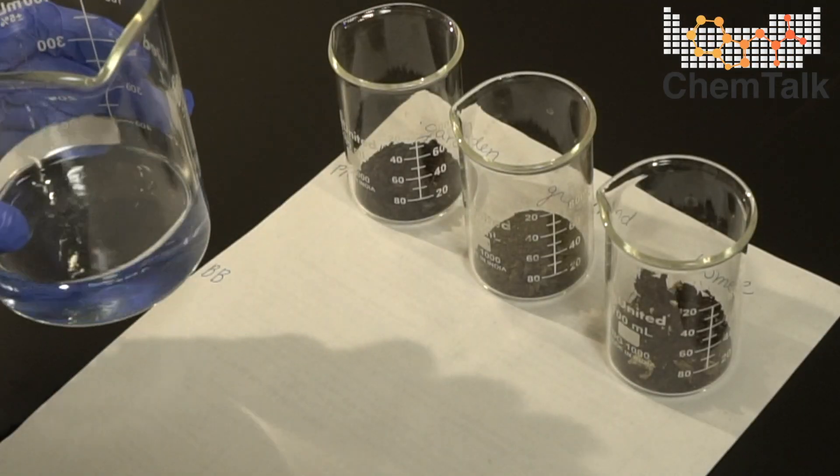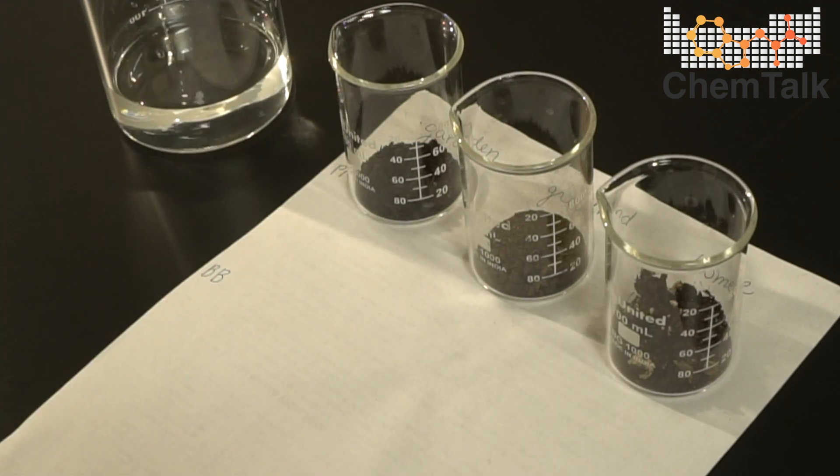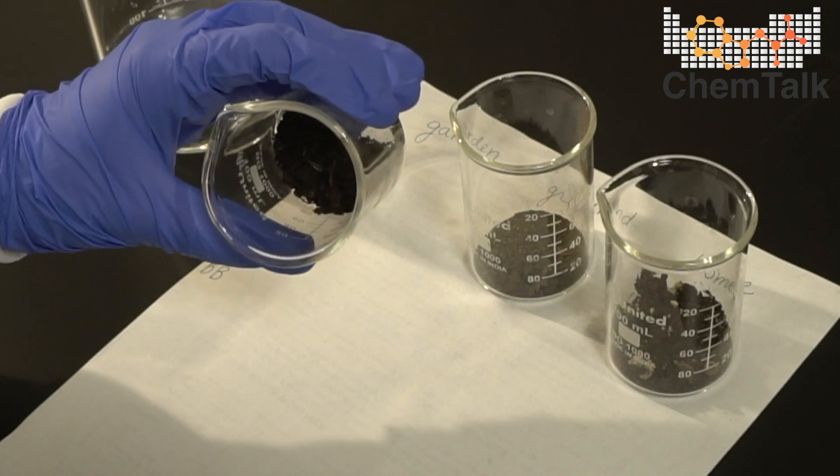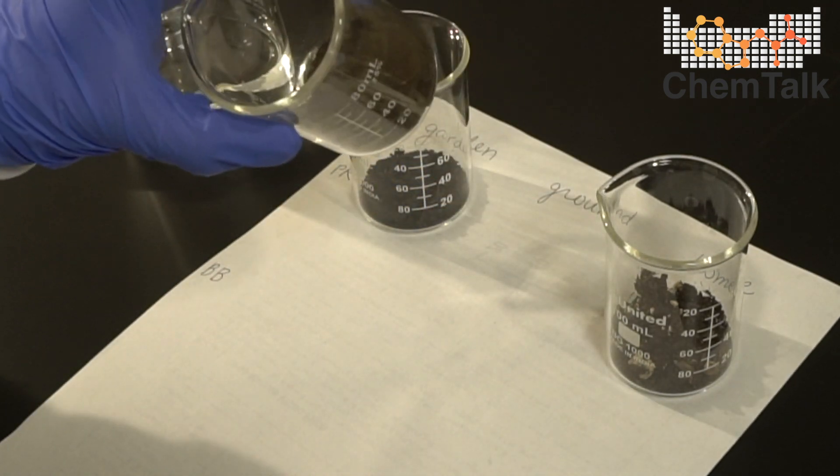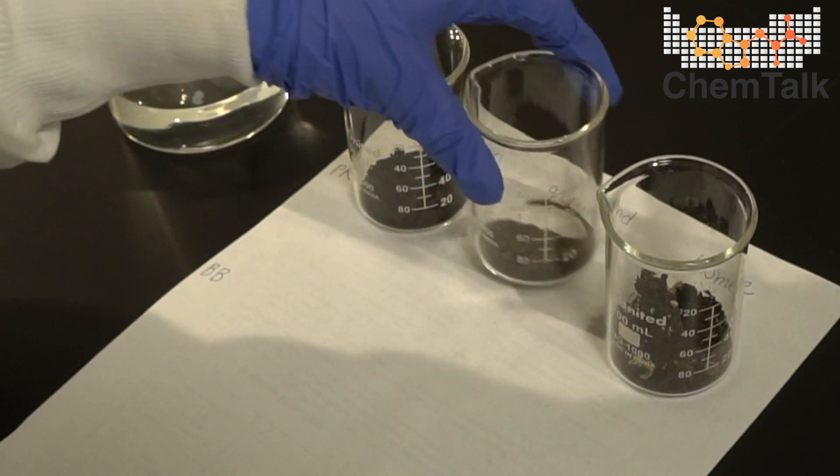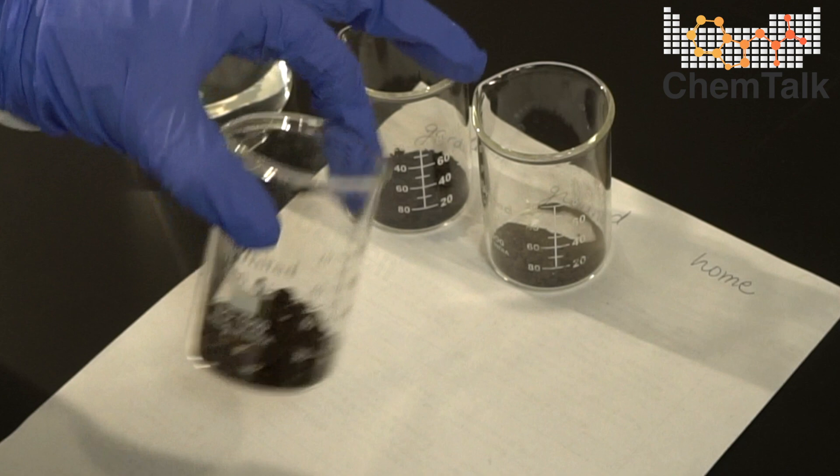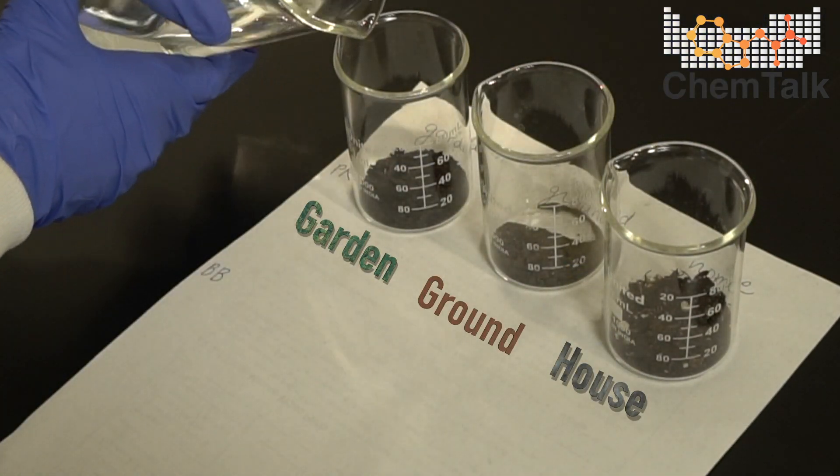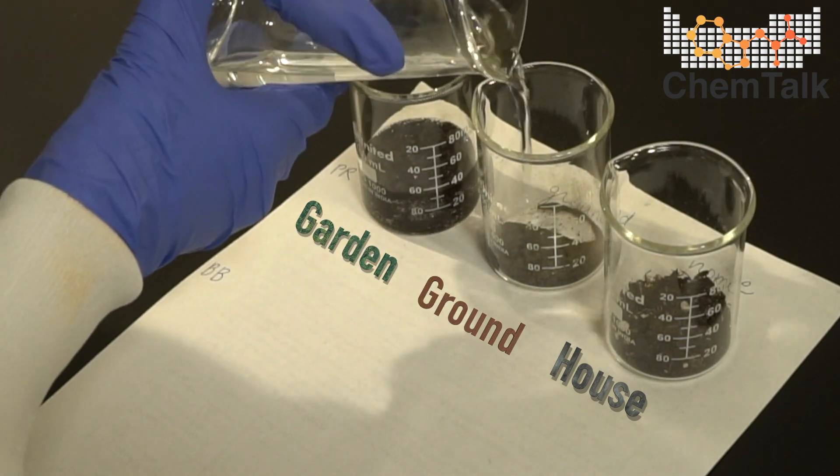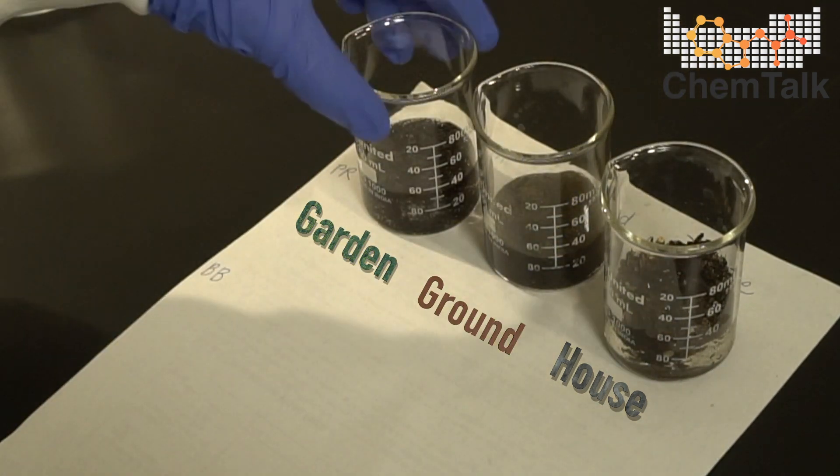I'm going to add water to these three samples and mix it around before filtering and testing the pH. This is the soil from the garden outside. This is the soil from the ground outside. And this is soil from my house, a separate location. And now I'm just going to add a little bit of water. Let it soak for a little bit and mix it around.